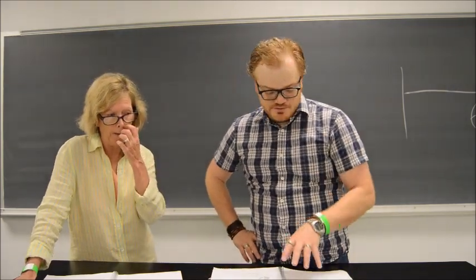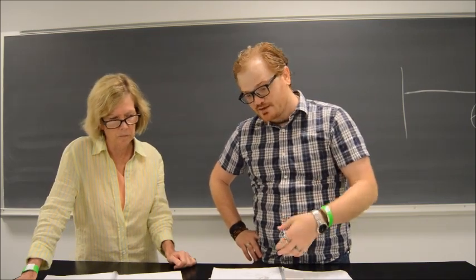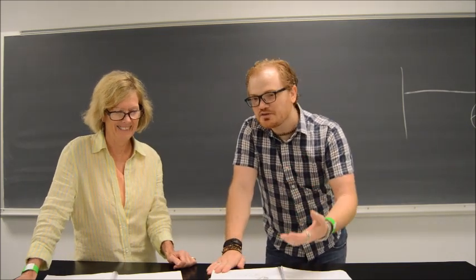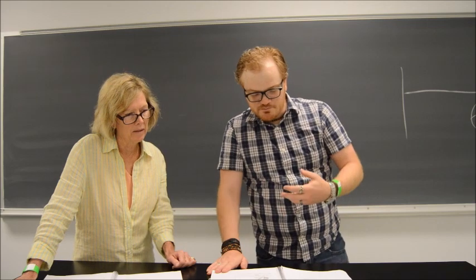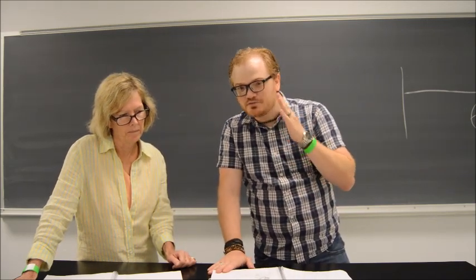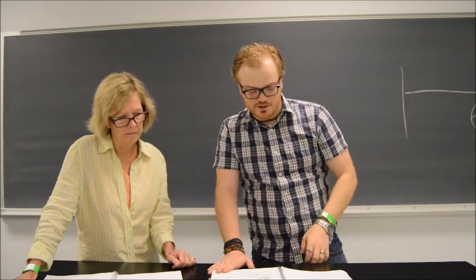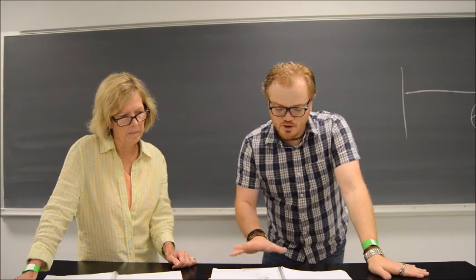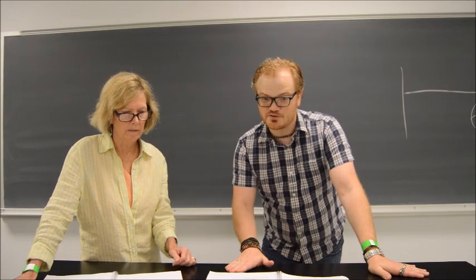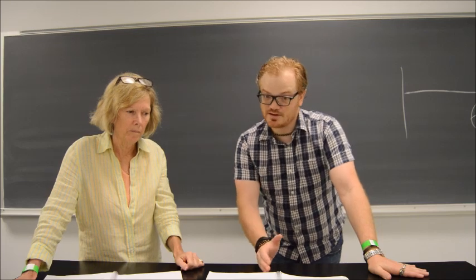Now, to do this, imagine you're presented with this solution and you have to identify what's inside of it. You can't just have the solution and run the test and hope for the best. What we try to do here with scientific experimentation is have methods of adding control to the situation so that we know, to some degree, for certain, that what we're doing is correct and we have identified things in a correct fashion. So for all of our experimentation today, we're going to display what's referred to as positive and negative controls. All right? Positive and negative controls, which are very important for scientific experimentation.